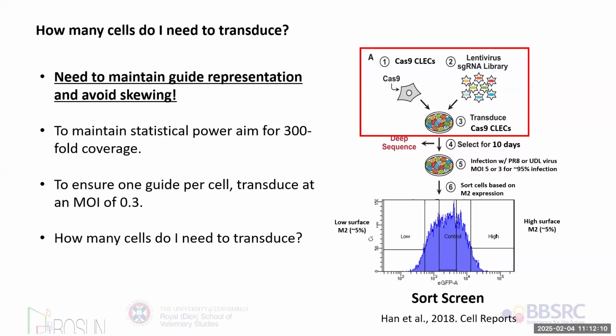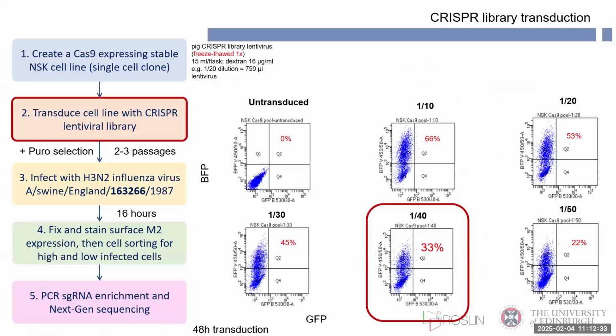Okay, so that's the first question. You've got to take into consideration how many cells you're going to have. It will also depend on the efficiency of your transduction. So some cells transduce much better than others. What helps a lot for that kind of thing is the lentivirus that I've said that we use, the PKLV2, has BFP fluorescence in it, and that was really quite helpful.